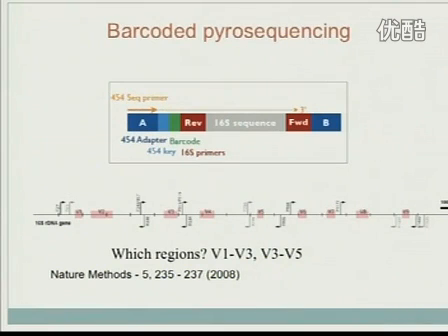Ideally, how many sequencing reads? What's the coverage for this? I think it really depends on the complexity of the sample. Some environments have very high complexity, with thousands of species. Some people will do very shallow sequencing, where you only get 16S from the very abundant species.